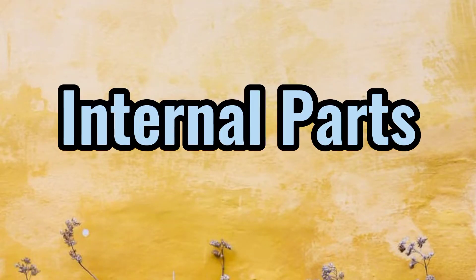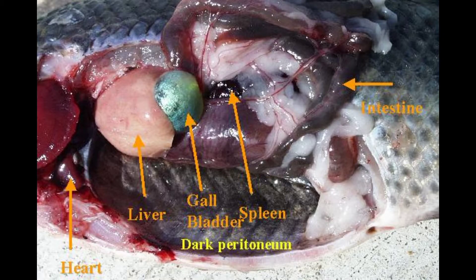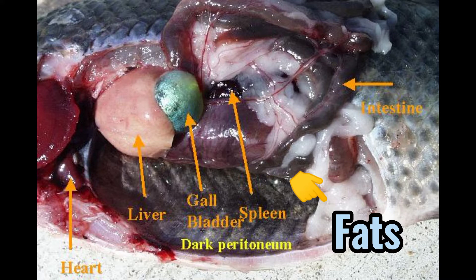Internal parts: Gills for breathing — oxygen and carbon dioxide diffuse here. Liver makes bile and digestive enzymes, and detoxifies. Intestine breaks down and absorbs food. Stomach breaks down food. Heart — its main function is to pump venous blood through the ventral aorta into the gills. Spleen filters out old and dead red blood cells. Swim bladder allows fish to float at any level. Testes make sperm.